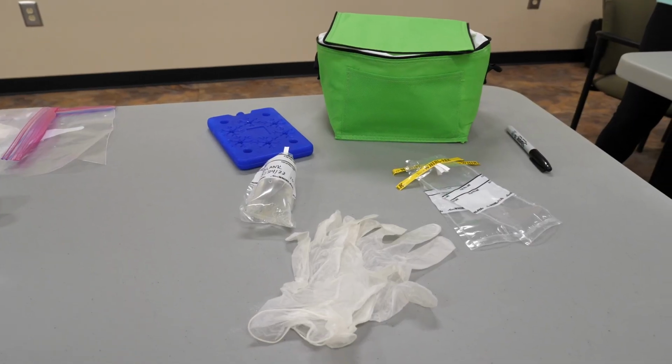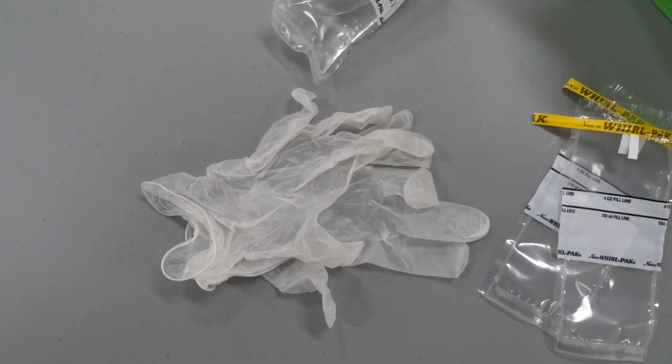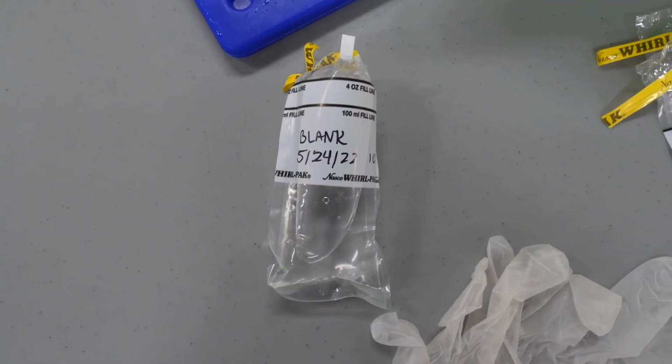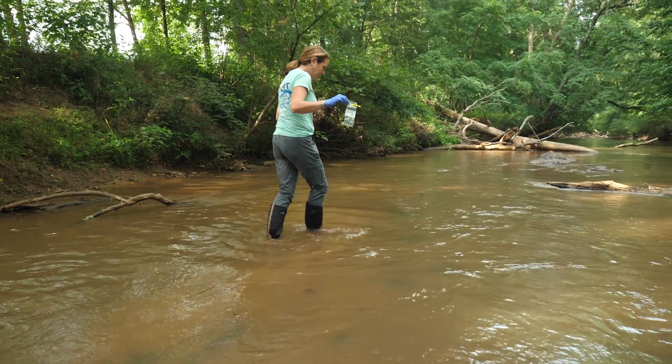For the field, you will need 1 Whirlpack bag per site, gloves, a disinfected cooler with ice or an ice pack, your blank tap water sample, your data sheet, and appropriate footwear.